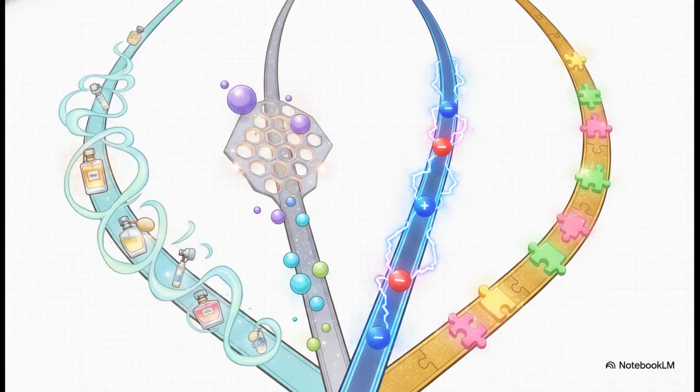Of course, while HPLC is absolutely perfect for handling delicate liquid-soluble substances, analytical chemistry is a huge field, and it requires a variety of specialized tracks for different types of molecular runners. For instance, gas chromatography, or GC, is basically tailor-made for light, volatile substances that easily turn into gas and are stable under heat. Think along the lines of perfumes or fuels.